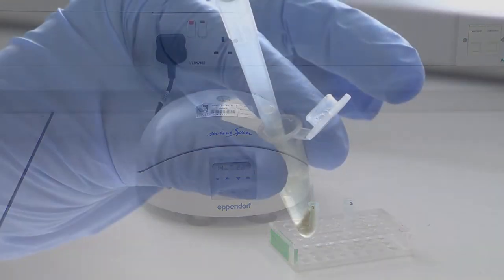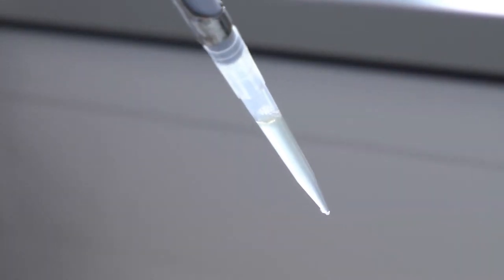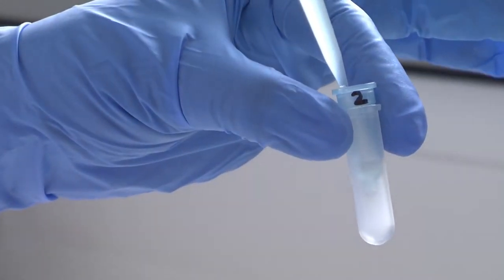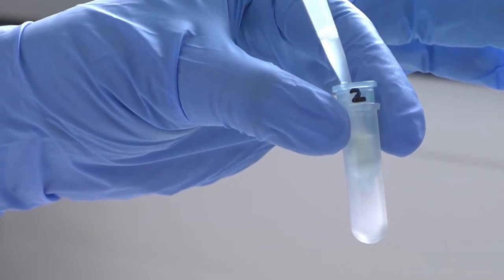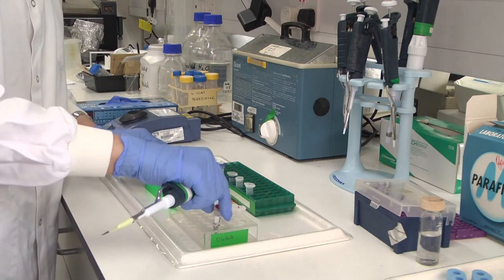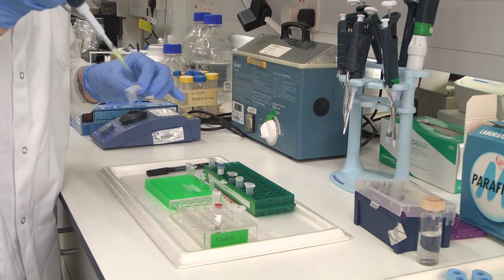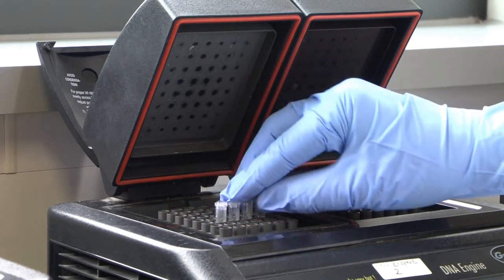We isolate the DNA from the algae which are making the fish oils and purify the DNA so we can introduce it into our GM plants. We use a technique called the polymerase chain reaction, or PCR, to amplify the specific algal genes that we want to introduce into our GM plants.